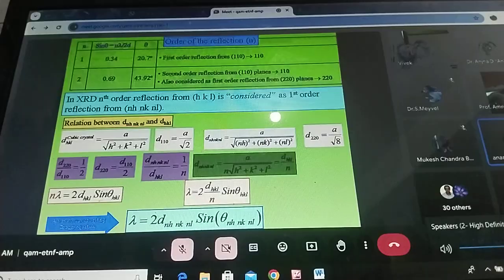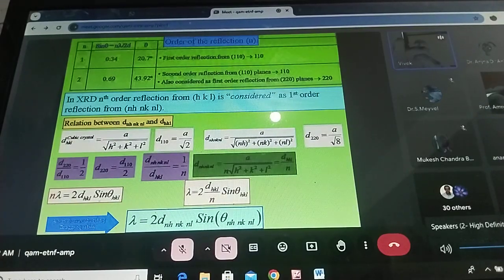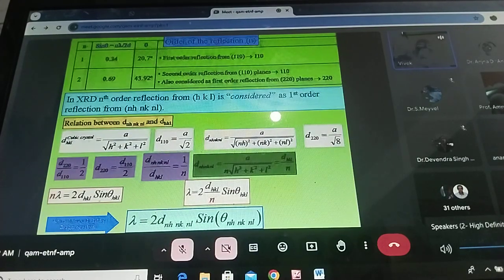My answer is, whatever study I have to do is in the crystalline form. When I make a crystal, if your sample is in the ionic form, it will not get crystallized. It will take an electron from the moisture or whatever the solvent is. So the molecule has to be neutral. I cannot crystallize a sample as Na plus or Cl minus.